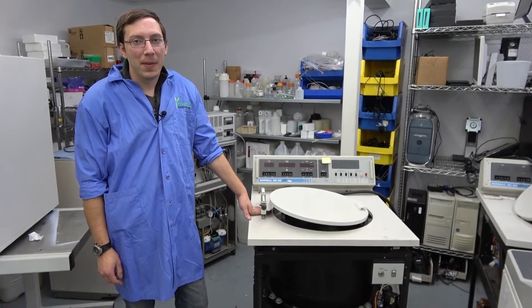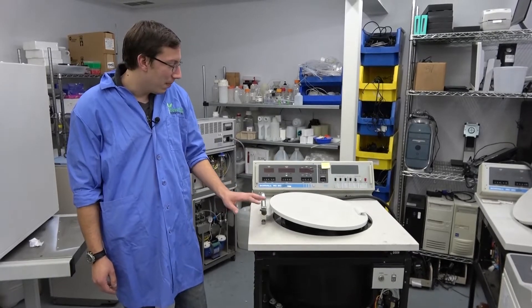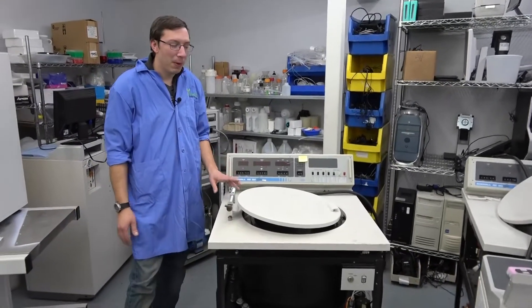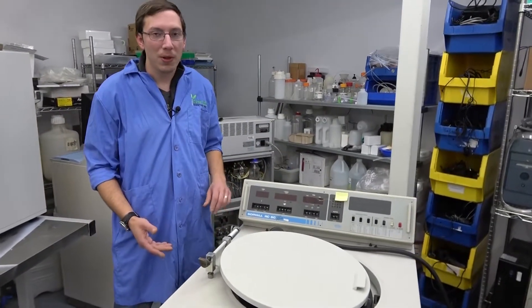Hi, my name is Bart Barthels and I'm here with New Life Scientific to show you the inside of an RC5C+. Normally we only give outside shots, but today we wanted to give you more of the inside — what's in it, how it works, and things you should look for.